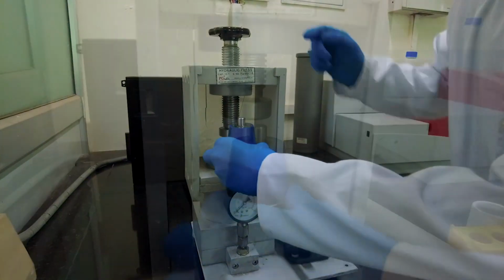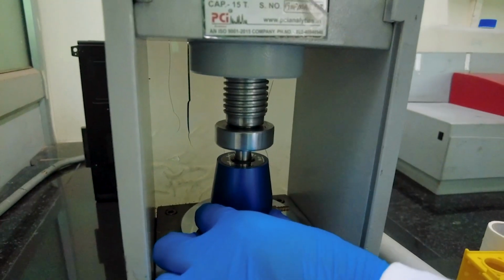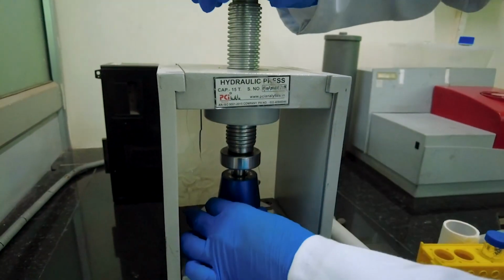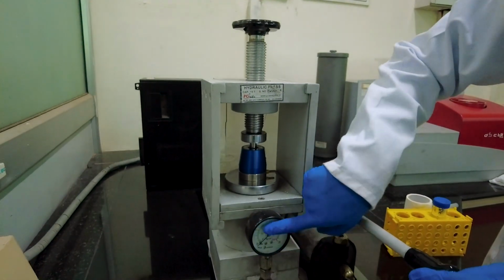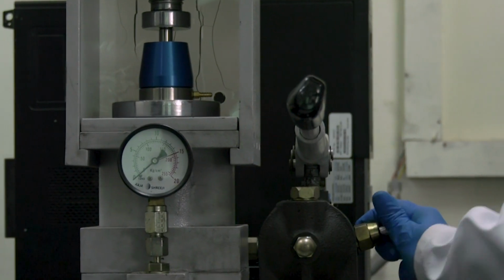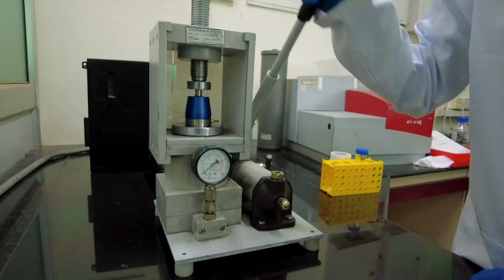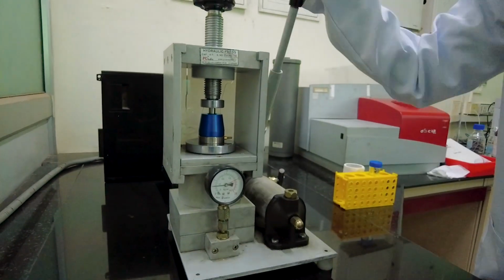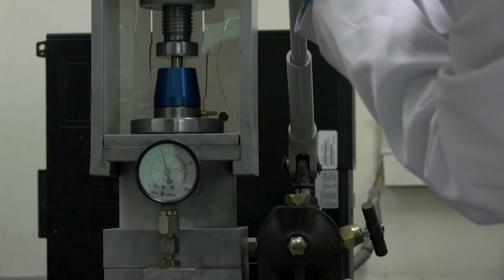Keep the pelletizer in the machine to apply pressure on the pelletizer. The pressure is currently 0, so we will first close the pressure valve and then use the handle to increase the pressure in the pelletizer, which will convert the powder into a pellet. Apply pressure on the pelletizer.